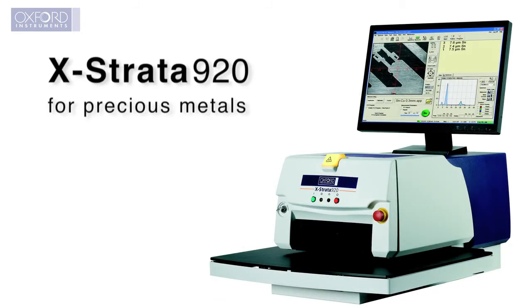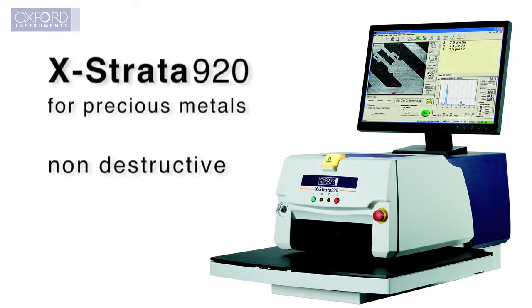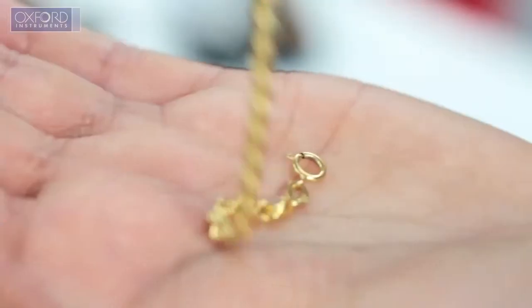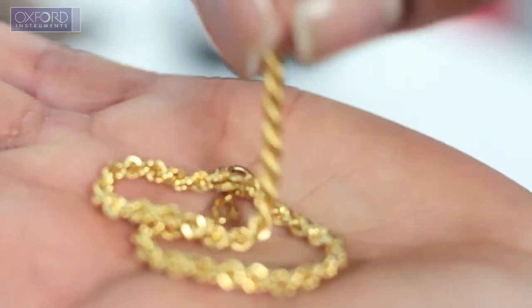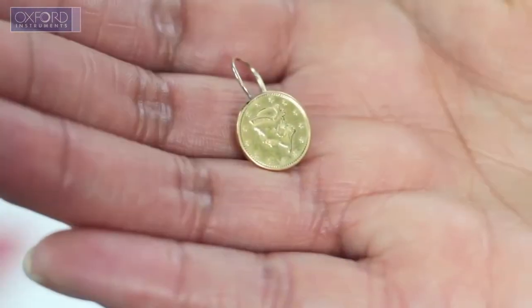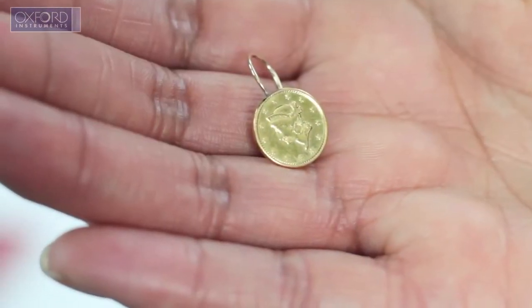The X-Strata 920 is a non-destructive, easy-to-use, cost-effective tool for analyzing metal alloys. It guarantees rapid and accurate analysis to maximize productivity.